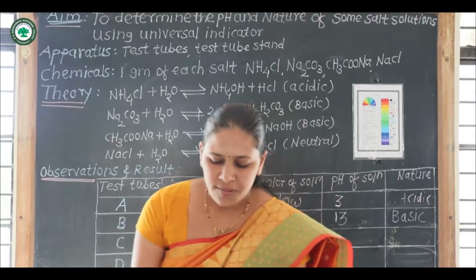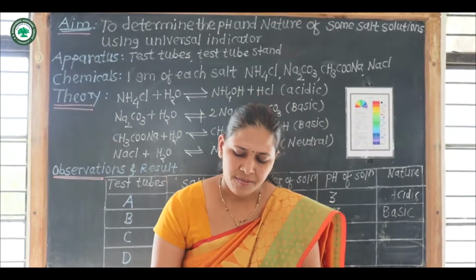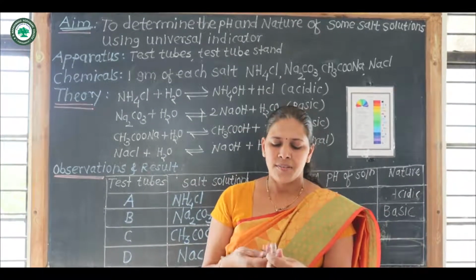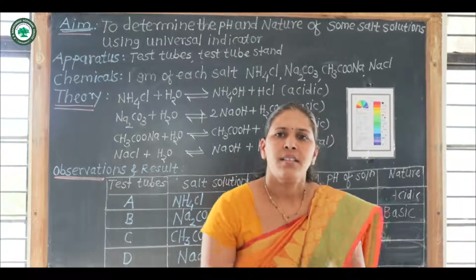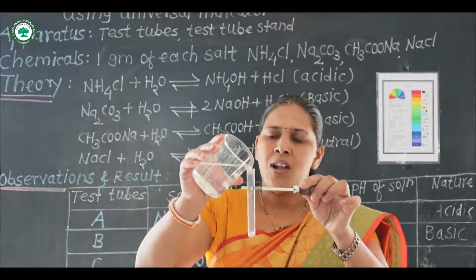Then the third salt, sodium acetate, taken in test tube C. Add a little amount of distilled water to dissolve the salt.